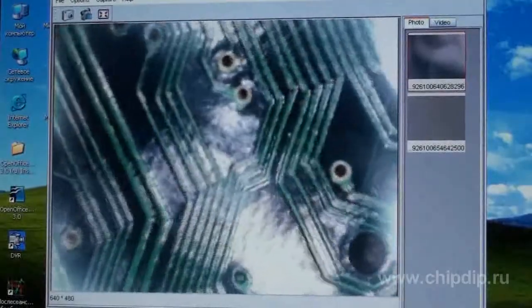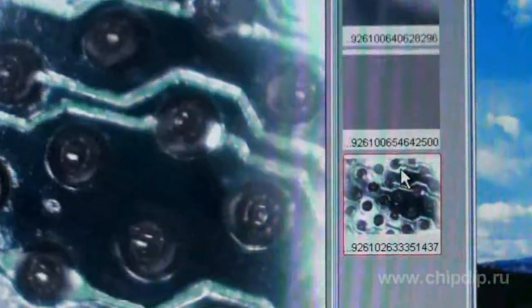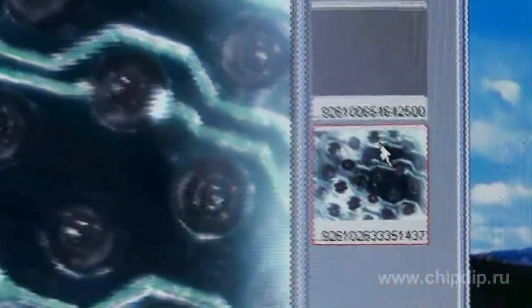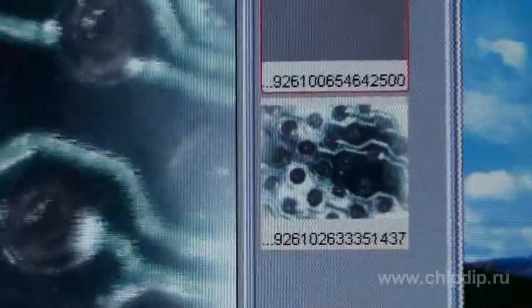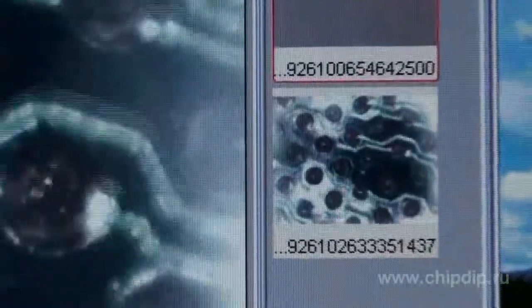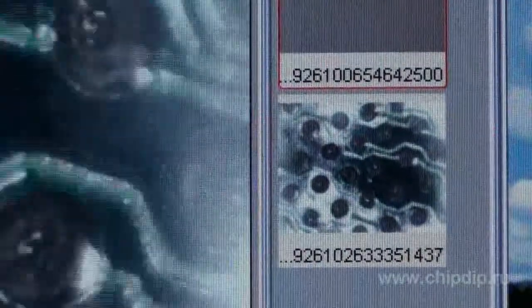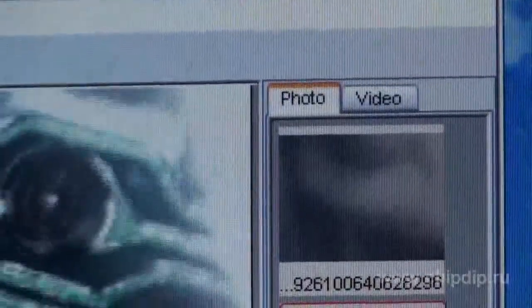Photo format JPEG, maximum resolution 1280 by 1024. Video format AVI with a maximum resolution up to 1280 by 1024. Frame rate 30 frames per second.